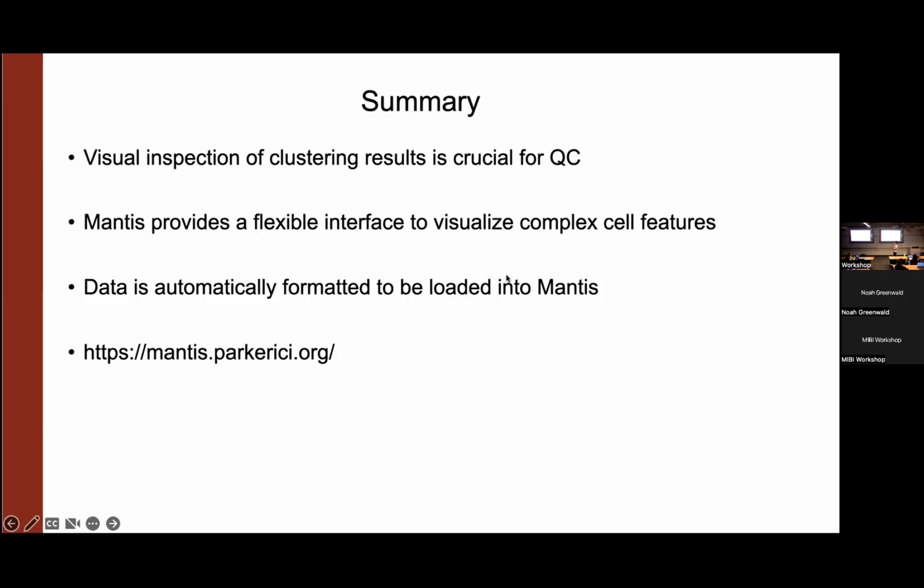The question was, can you look at multiple FOVs at a time? Not literally at the same time, but at the top, similar to how there's a drop down for different channels, there's a drop down for different images that are in that data set. So you just change the drop down and it'll load a different image. It's not going to load multiple ones side by side, but I don't think that would be so useful for this case, because you need to zoom in close enough anyway to see what you're doing that it's easy to just switch to a different image.